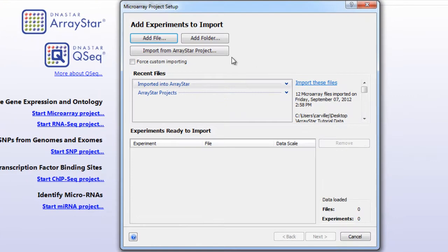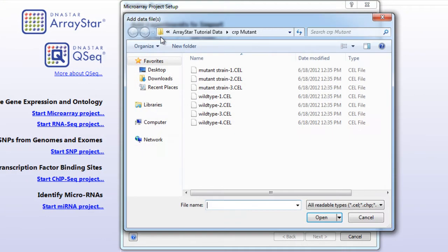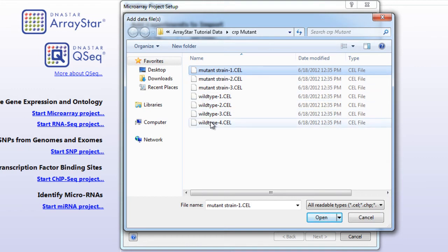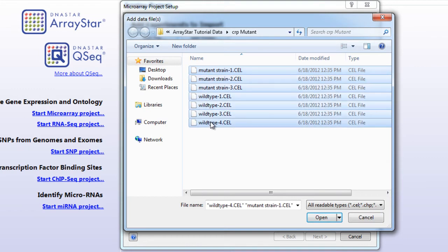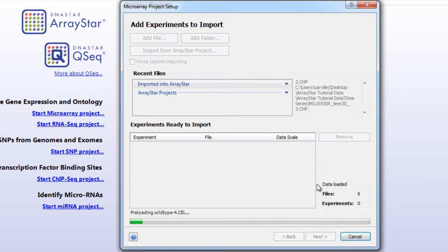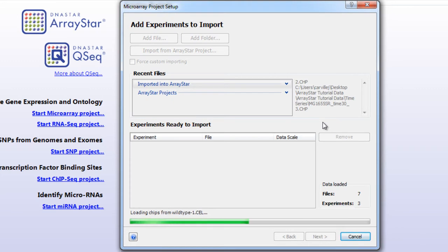To analyze gene expression patterns, the first step is to import your data. ArrayStar can import data provided by Affymetrix, Roche-Nimblegen, Illumina, and Agilent, and also offers a custom import wizard for data files from other sources.